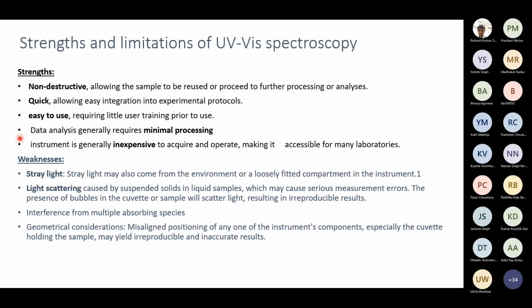The third strength is that it is very easy to use. It does not require any expertise or specialized training with the instrument. Anyone with the basic knowledge of how to put the sample in, how to take it out and how to analyze the reading can use it easily. And the second thing is once we get the data from the device, it is very easy to analyze, and we can convert it into graphs, and that we will see in the experimental parts.